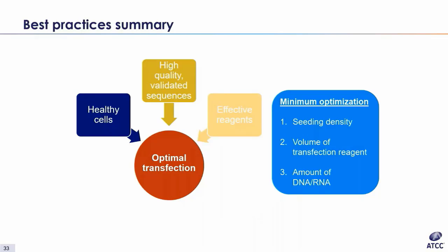And so this is the very last slide on transfection, and it's going to summarize best practices for the transfection section of this talk. To achieve optimal transfection efficiency, use healthy cells in the exponential growth phase, free of contamination, DNA that is of high purity and endotoxin free, and the recommended lipid for each cell type and substrate should be determined. Every setup may require some optimization, including but not limited to seeding density of cells and the ratio of lipid to substrate.